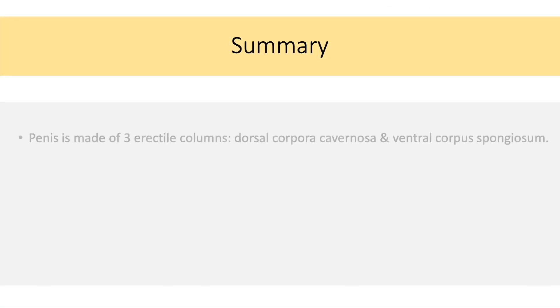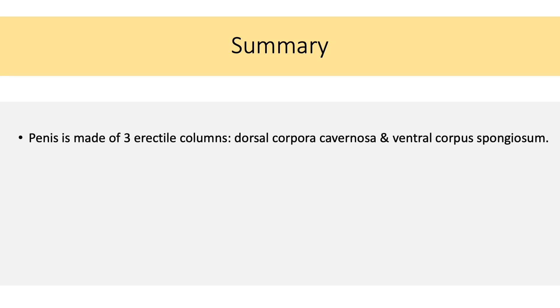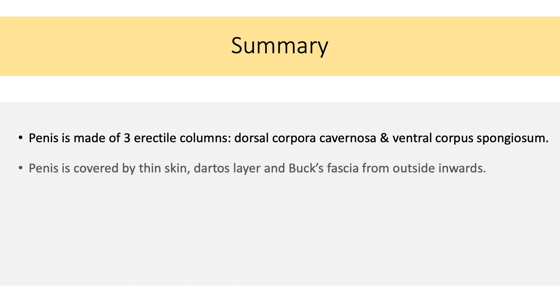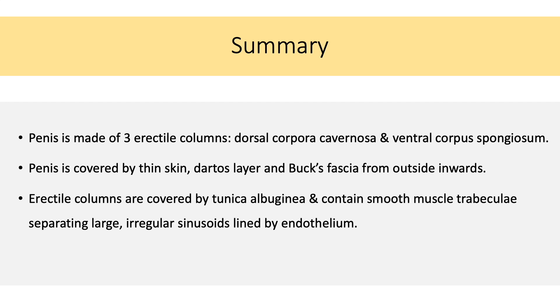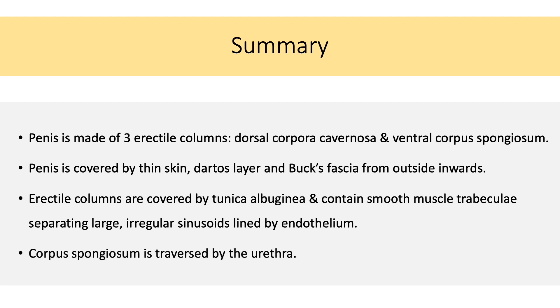Quickly recalling what we have seen so far: penis is made up of three erectile columns — dorsal corpora cavernosa and ventral corpus spongiosum. Penis is covered by thin skin, dartos layer, and Buck's fascia from outside inwards. Erectile columns are covered by tunica albuginea and they contain smooth muscle trabeculae separating large irregular sinusoids, which are lined by endothelium. Corpus spongiosum is traversed by the urethra.